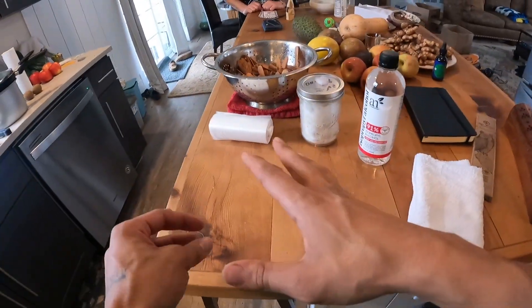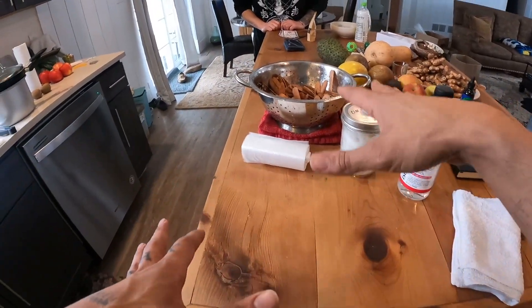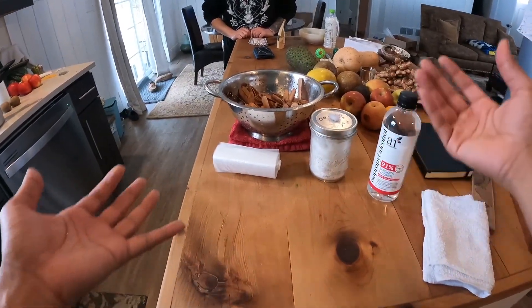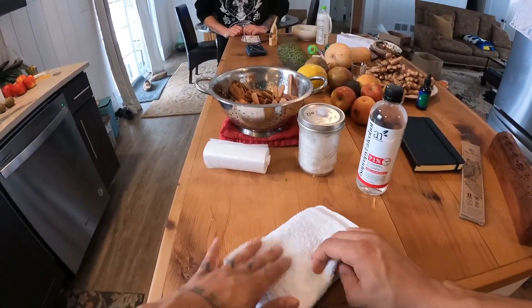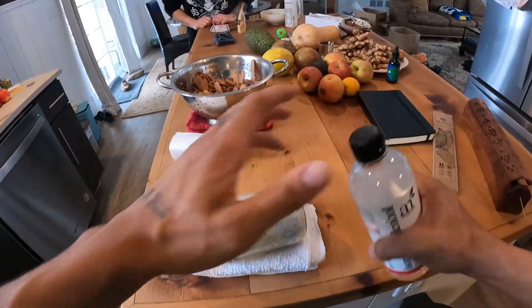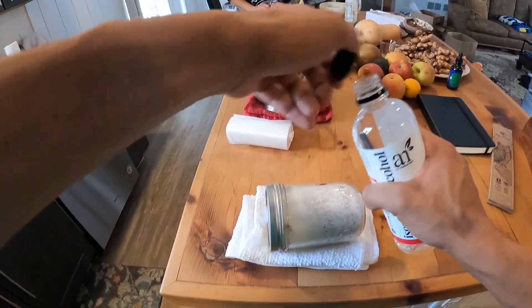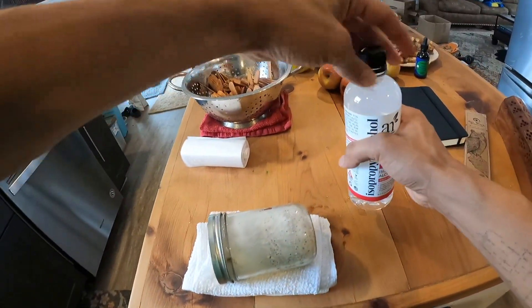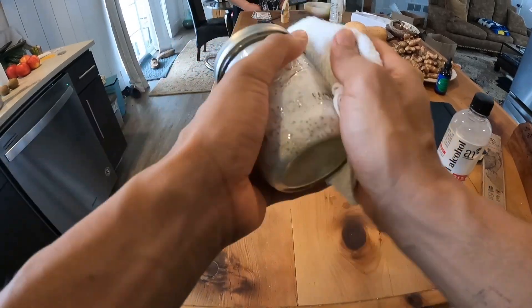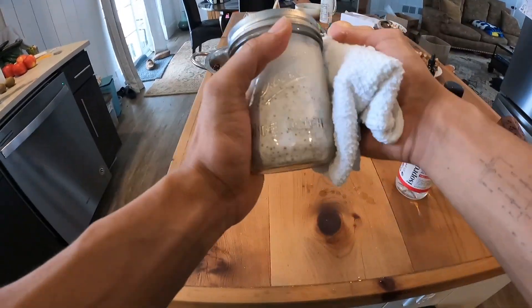We're going to act a little bit fast here because we want to make moves while this is still a little bit warm. As it cools down, there's opportunity for other things to start living in there. So one of the first things we're going to do is clean off our spawn jar with a little bit of alcohol and a clean rag.